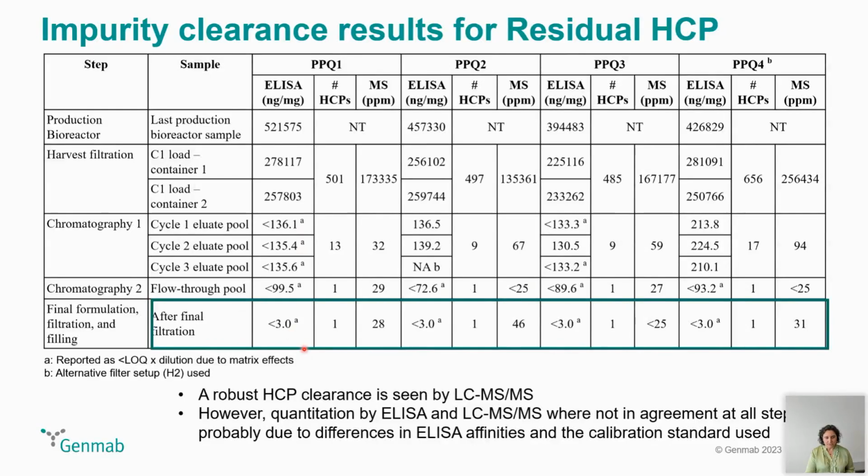Another thing we can also take from here is that the LC-MS, even though you have a quantitative result, it's limited by the method.